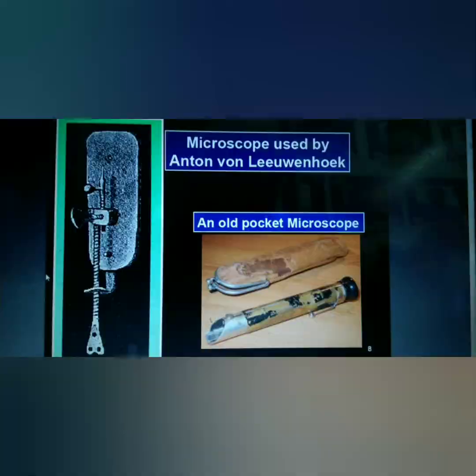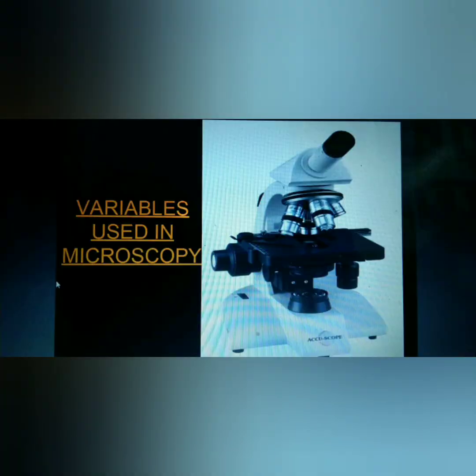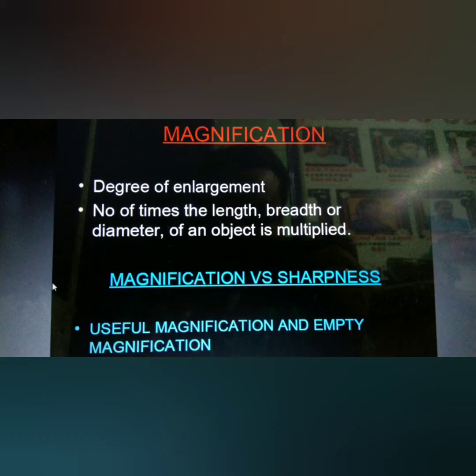Right, students? Next. Now the picture you are looking at is the most modern picture of a microscope, which can be observed in our laboratories and in many research laboratories also. It is basically a compound microscope with many facilities and amenities. Nowadays you know that without the microscope the world of microbiology is dark actually, and nowadays it is more important, because if you think about the coronavirus and these other things, this becomes more important.